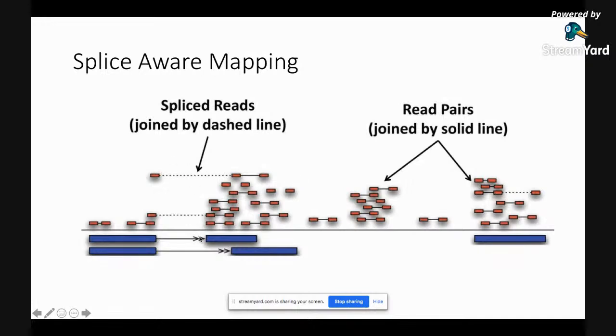So this splice awareness is important because otherwise these things will be missed. When you make an alignment score, it will have a very bad alignment score against the genome because only half of it is aligning and the other half is technically not aligning because it's not a continuous region on the genome, right?